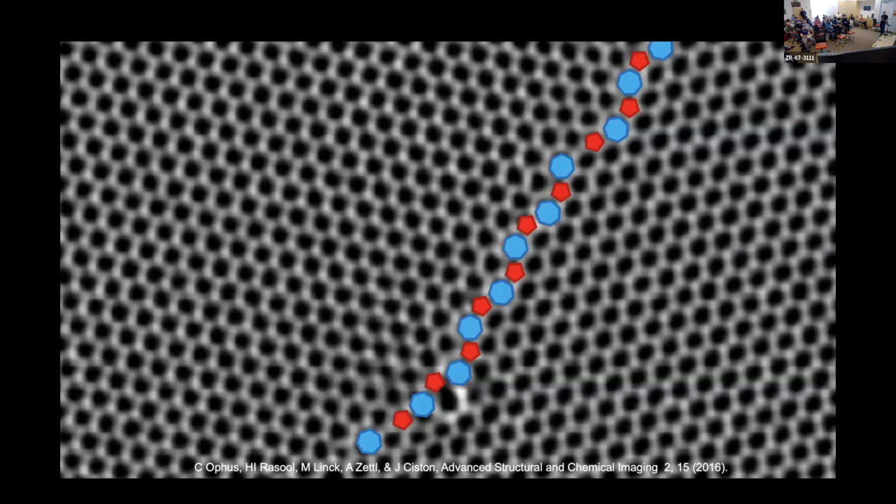It's extremely dose efficient. And one great thing about electrons is they interact incredibly strongly with the sample. One terrible thing about electrons is they interact incredibly strongly with the sample. It's kind of like sandblasting a soda cracker. Our electrons will obliterate things that we're imaging at atomic resolution. And that's why we need phase contrast imaging methods, because they can be up to about 50% efficient. Whereas the incoherent imaging modes or nanobeam diffraction imaging modes are usually ballpark 1 to 5% diffraction efficiency or imaging efficiency.